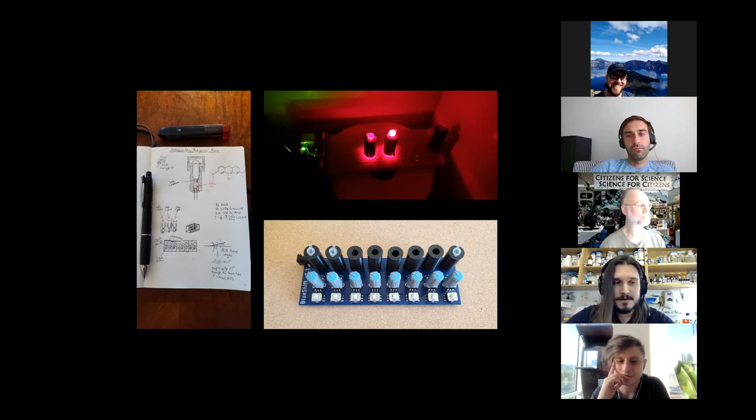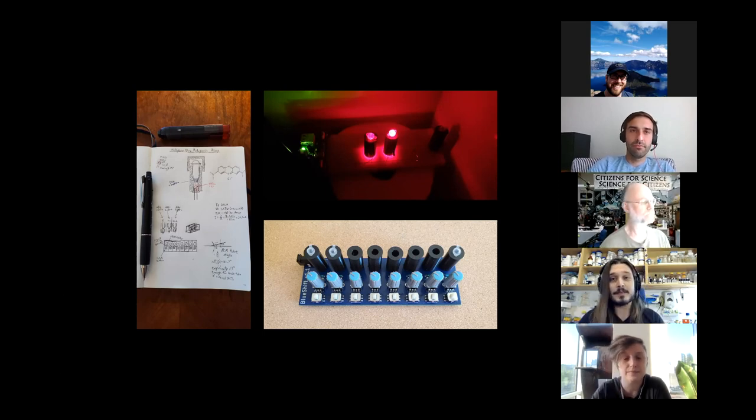But there is a slightly safer alternative, which is a really common microscope stain called methylene blue. Now, methylene blue by itself does nothing. But in the presence of 660 nanometer light, so very red light, it starts producing reactive oxygen species. The nice part about methylene blue is that it also intercalates with DNA. So it actually slaps onto the DNA major groove, just like ethidium bromide, for example. And then when you turn on the lights, while attached to that major groove, it starts spewing out reactive oxygen species as it reduces in the environment. So it produces singlet oxygen radicals, which shear and break DNA.